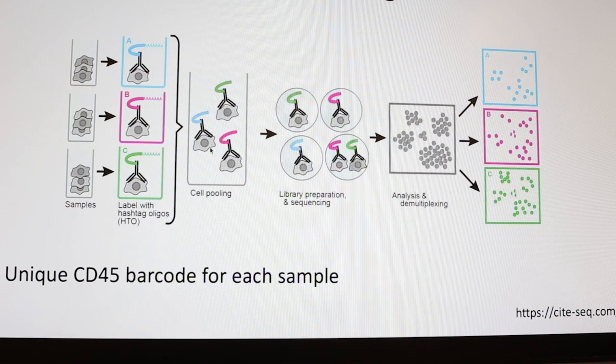Okay. But it's not strictly necessary to use CD45. In my case, CD45 is the most obvious, but in other experiments, you can tailor this to whatever might work the best for you. And I think in our iCellR, you have a function to demultiplex this. Yeah, I can show you some part of your data, how it works.